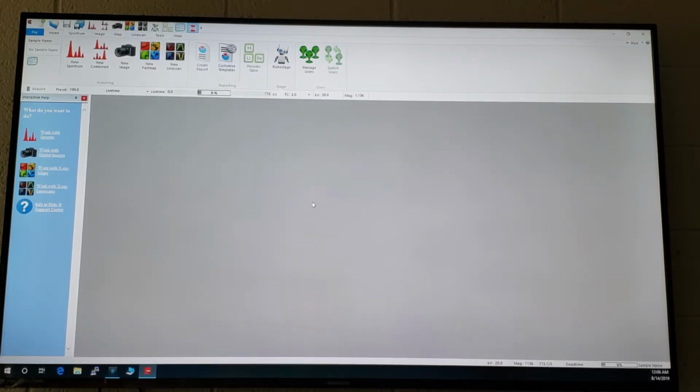So this is the IXRF window. This is how it opens as a base default. Very similar to the one that we put on the camera. That's correct. Newer software version, but very, very similar. So you guys have the IXRF package on that SEM without a detector to analyze everything. If you had a detector working, we could hook a detector up and pull X-ray events off of that too. Anyway, that's a whole different thing.